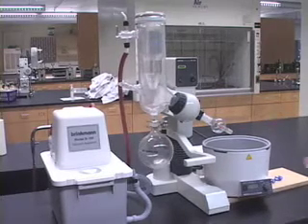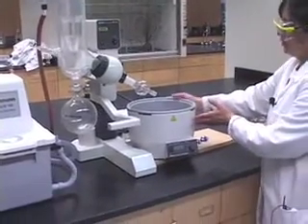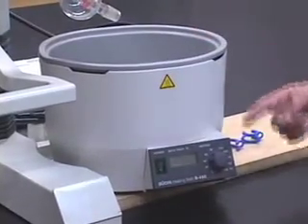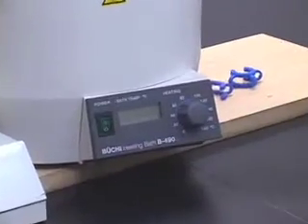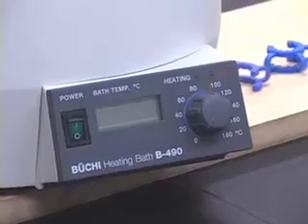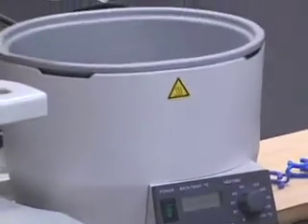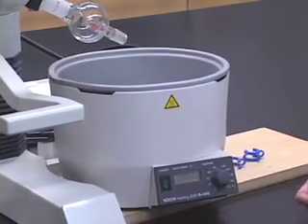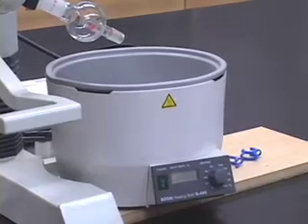First of all, what you see here is a water bath in which we can take water and, using the heating dial here, we can, if we need to, heat the water so that evaporating off the higher boiling liquids becomes easier. But in most cases for this purpose here, we may not have to heat the water.